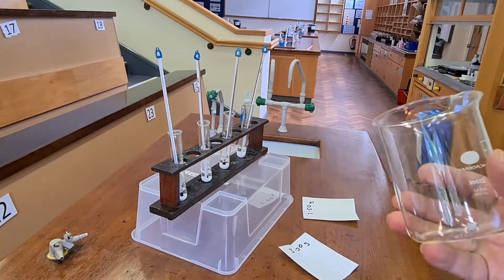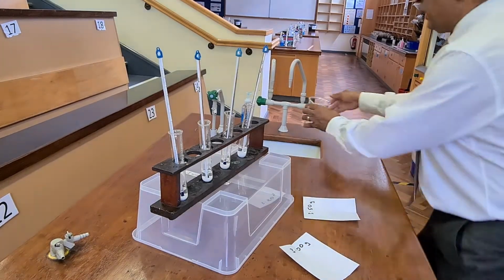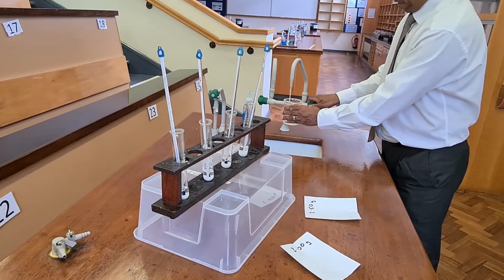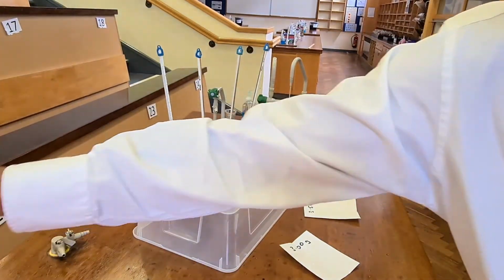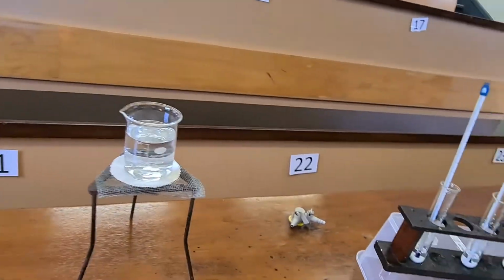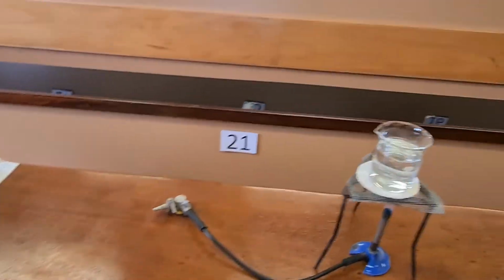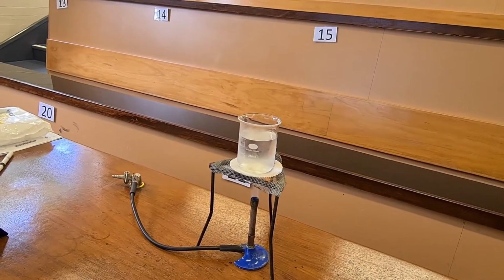Now I'm going to get a beaker and fill it full of water. This is for the water bath. Water on there, and I'm going to start heating.